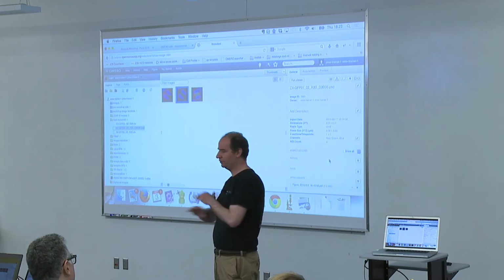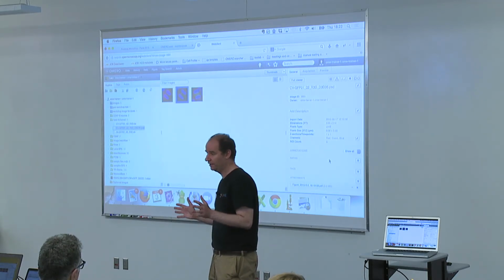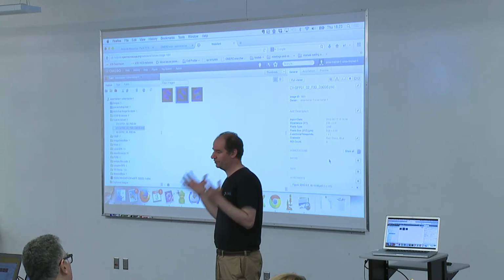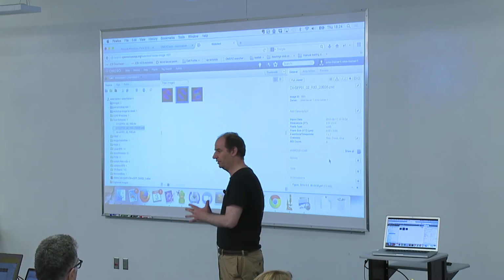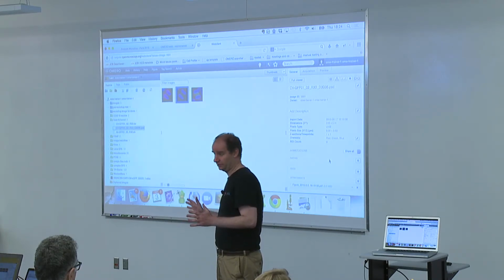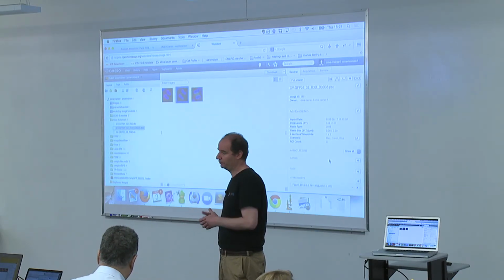Meaning if everything goes pear-shaped, the whole OMERO server goes down and you will never recover the whole DB, God forbid, it doesn't happen, but people are worried about that. If your IT manager, your system administrator did his basic backups and backed up the original data, the data are still there and still readable in the original files using the original software as they were when they were coming to OMERO. So they are untouched. You have the original data still stored, whatever OMERO does or does not. So that's the philosophy.